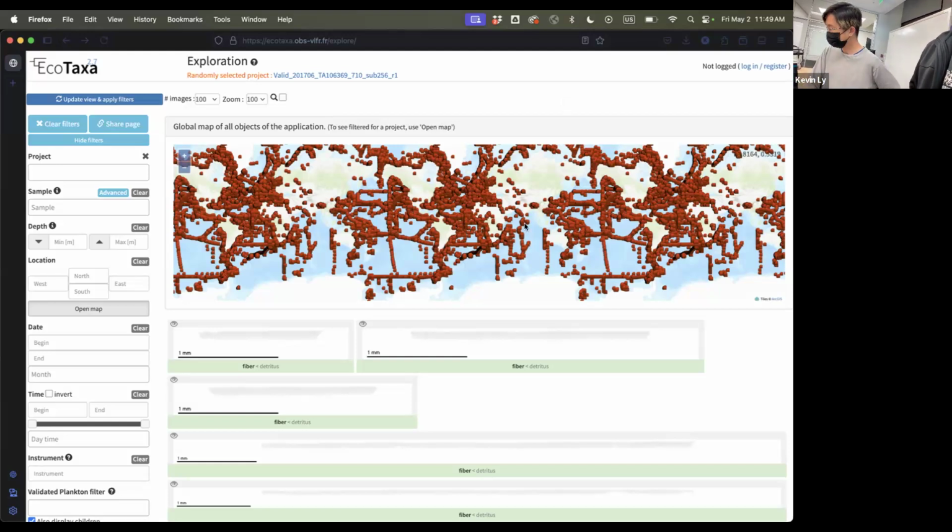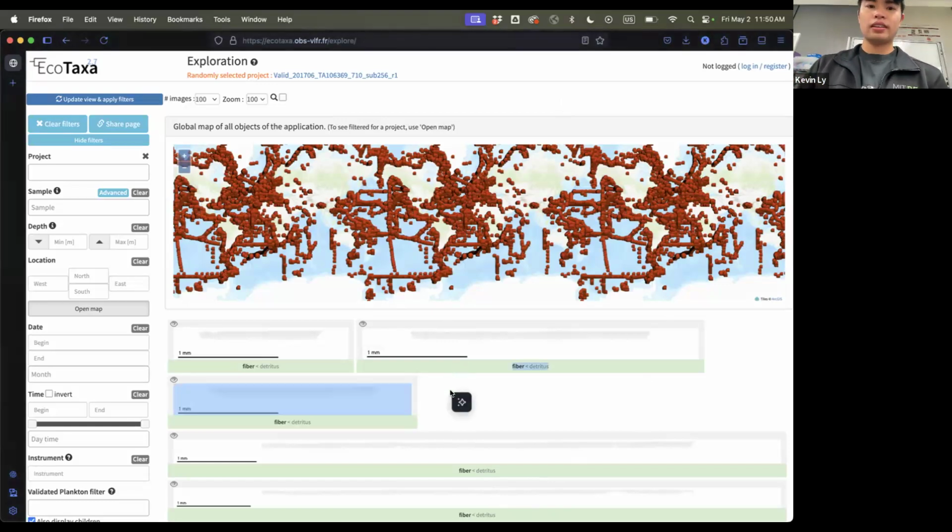Is the water just going back into the sea? Yeah, just because I don't want to waste sample. But usually what you would do is put it in the waste tube, because the pump crushes stuff that passes through, since it's a peristaltic pump. It doesn't crush everything, but it crushes enough things.